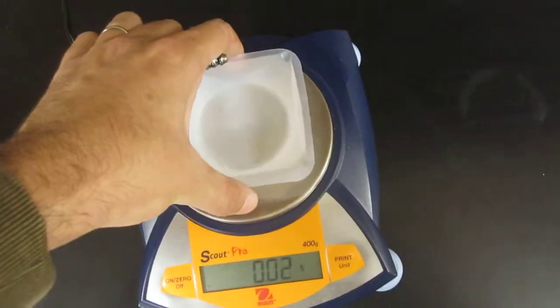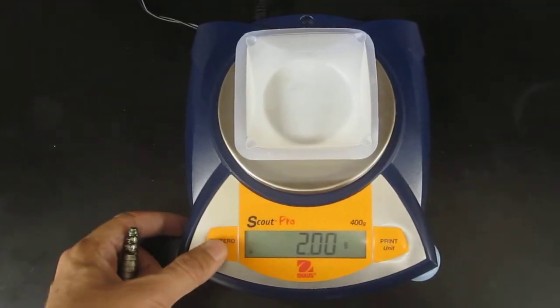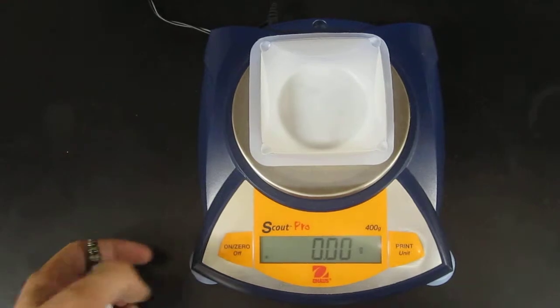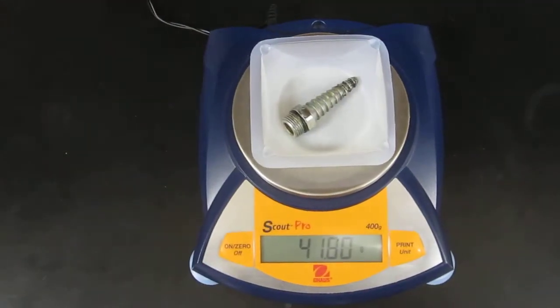So the first thing you want to do is put a weigh boat on your balance, tare your balance or zero it out, and then weigh your irregular object.